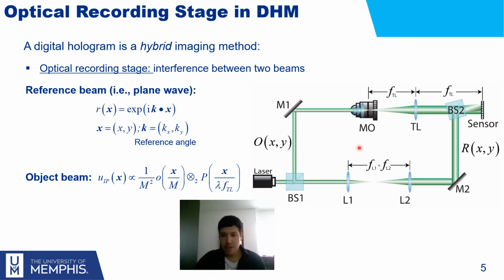One of the arms of the interferometer is a microscope, essentially a bright field microscope, and it magnifies the information of the sample that is scattered and therefore encoded in the object wave that illuminates the sample. At the sensor camera, this object waveform is superimposed with the reference waveform, which is a plane waveform. What is recorded in the sensor camera is what we call the digital hologram.